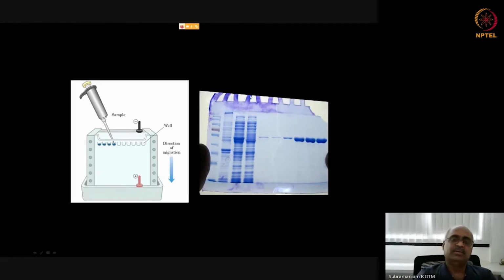Okay. So here, what I have done is I have lysed bacteria, the E. coli bacteria that we normally grow in the lab, and separated them on the gel, and each protein appears as a band. And this shows stages of purification. We see here an E. coli strain that is genetically engineered to produce a certain protein, and that is this protein here. This is present here, not in this. So this is normal E. coli that doesn't produce that protein, and this one is producing that protein. And I have used affinity chromatography to purify this one out. And you see here, this pure protein is visible while most of the others are removed.